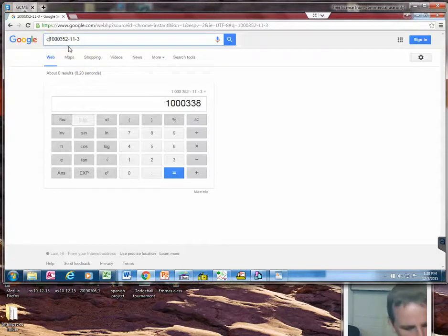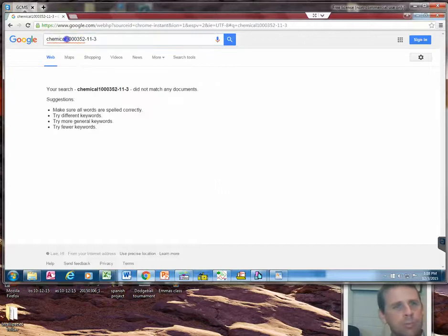So let's write chemical. Let's try CAS number. I don't know.